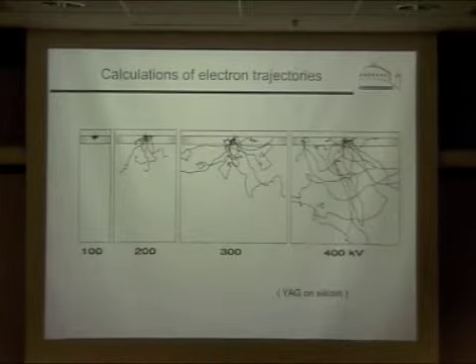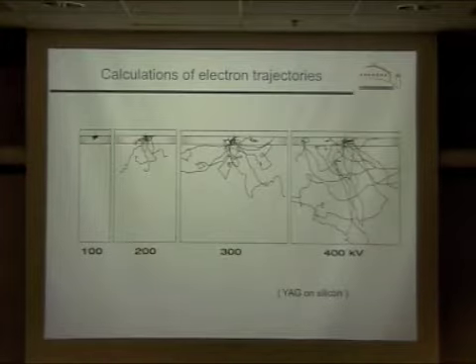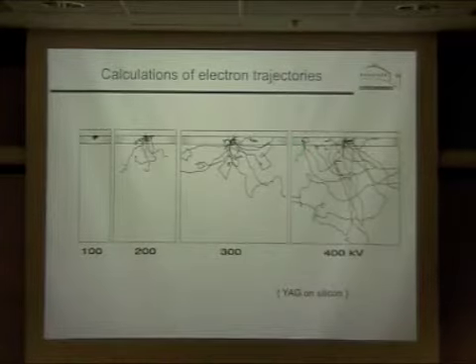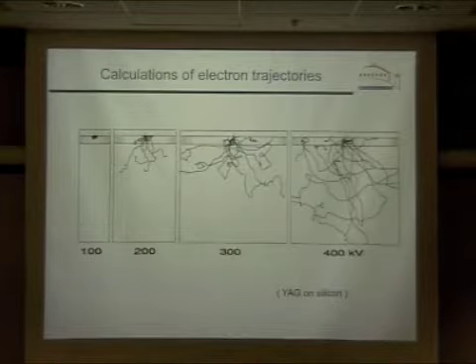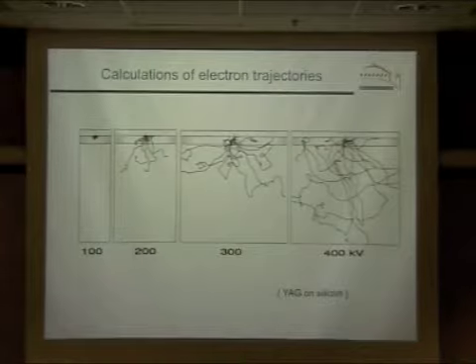So that's entirely possible. So look at single electron tracks. Each one of these simulations, I think, is a summary of about 20 electron tracks. If you look at a single track, you would almost always see a spot in the center here. And then occasionally you would see another spot where the electron came back into the center. Now that would be a bigger spot because the electron has much lower energy at that point. Of course, the energy deposited per distance traveled is going to be much greater, and the amount of light that it produces here could be a lot more than the amount of light it produces as it goes through the first time.